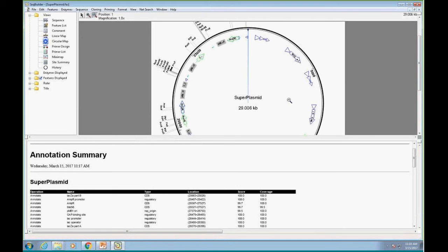We can go larger. I've done up to about 300 kb for some environmental plasmids, and that's about what we've designed this particular tool for, sequences in that size range. Now, these are single sequences. It's also possible to do multiple sequences.